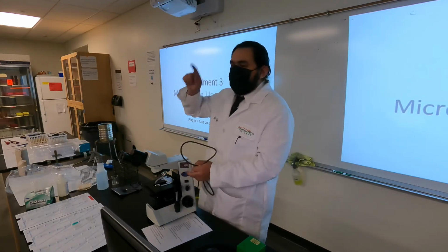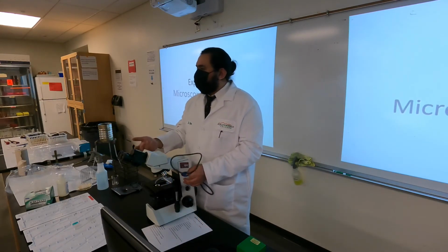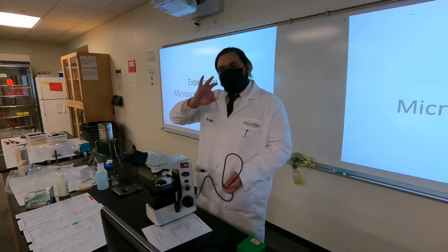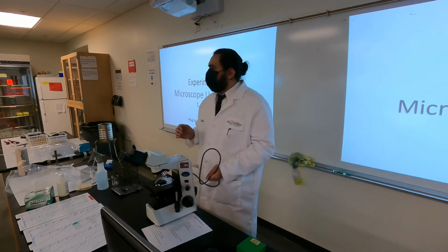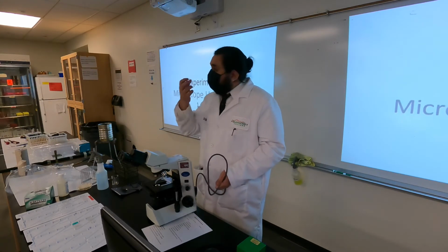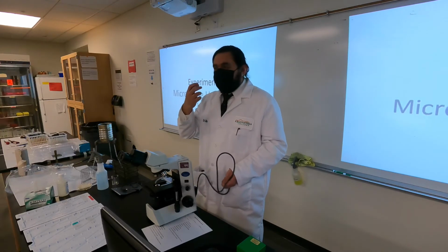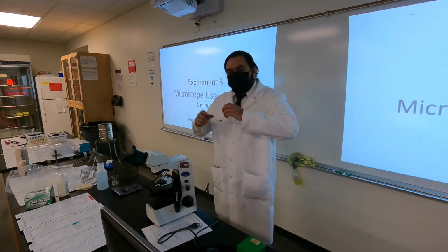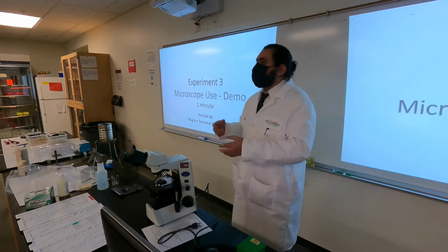Now, once you do that, you're going to want to turn on the switch from that little circle to that little line, so that you turn on the scope. And then you're going to want to turn your dimmer from that 1 to about a 3 or so. That should give you a decent amount of illumination without staring too much into the oculars and giving you a headache. A lot of light focused directly into your eyes will give you a decent headache, so be careful with that. Once you have that up and set to your slide, then we'll start observing stuff.